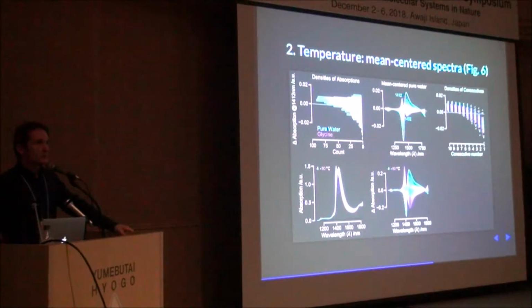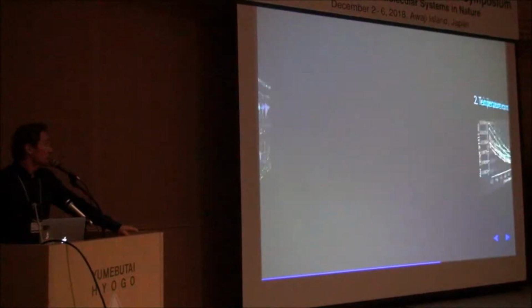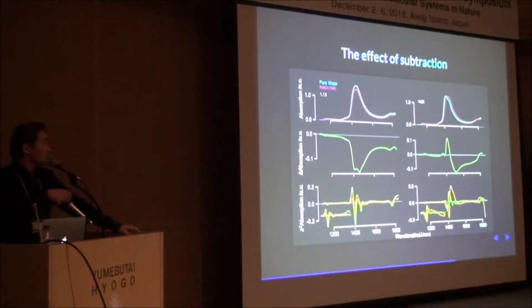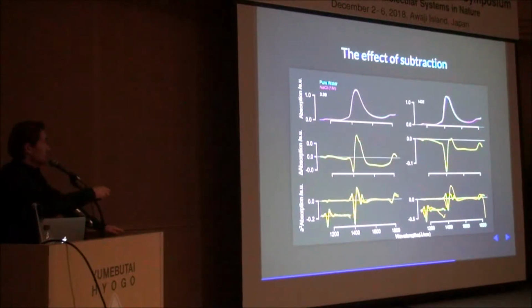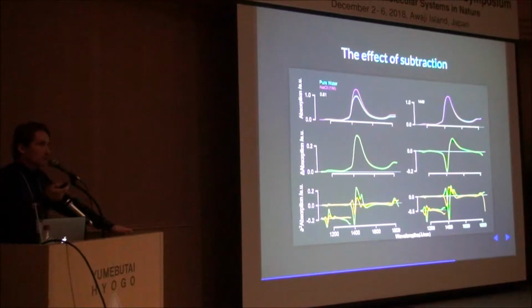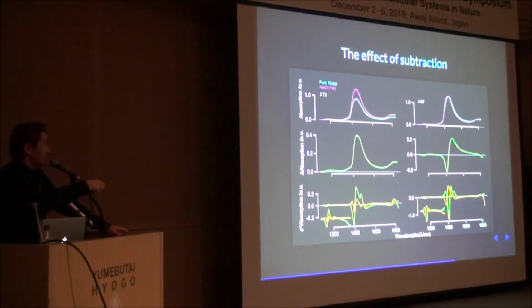So we already generated all the temperature influence that we can deal with theoretically, and we use this database to subtract the closest spectrum to the spectrum that we are measuring. And the effect of subtraction of different wavelengths is shown here. With this animated slide, we're working with sodium chloride. Any other solution at 1 molar for this purpose is good enough.